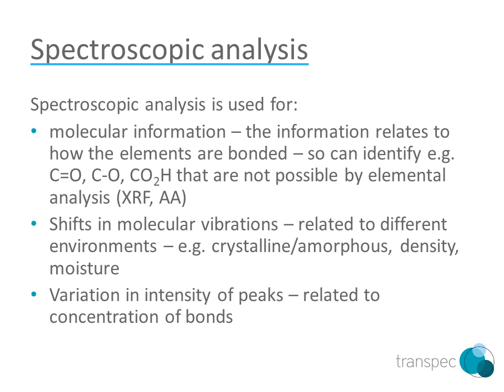Spectroscopic analysis is a very powerful tool as it gives molecular information rapidly and thus gives chemical information relating to bonds. This puts it ahead of techniques such as XRF and atomic absorption, where only elemental information can be gathered. The molecular vibrations seen in spectroscopy are not only governed by the atoms attached but also by the environment, so there will also be relationships to crystallinity, density and moisture, for example. The intensity of these peaks can also be related to the concentration of the materials, so quantifying components is also possible.